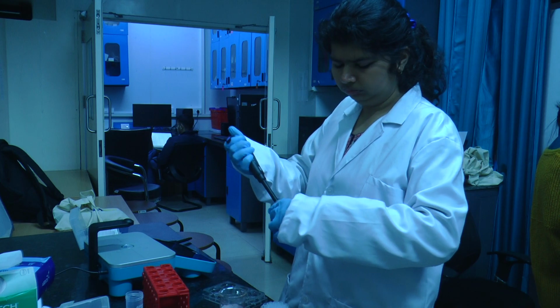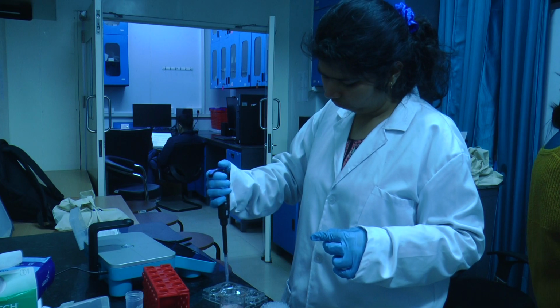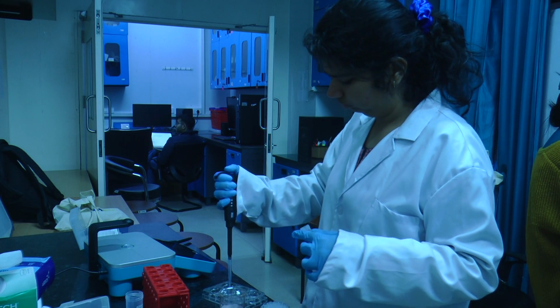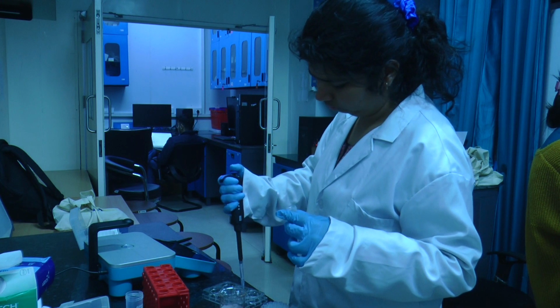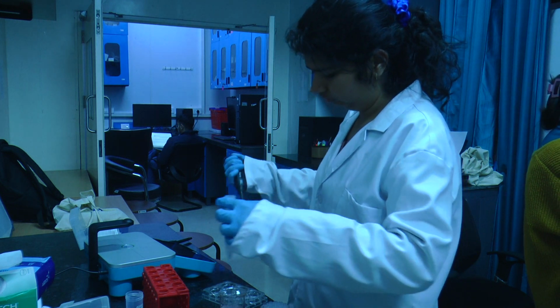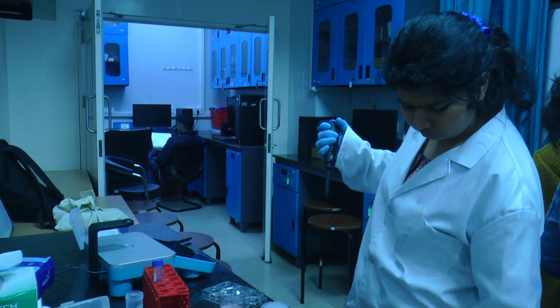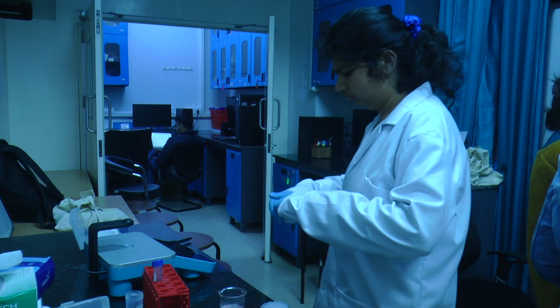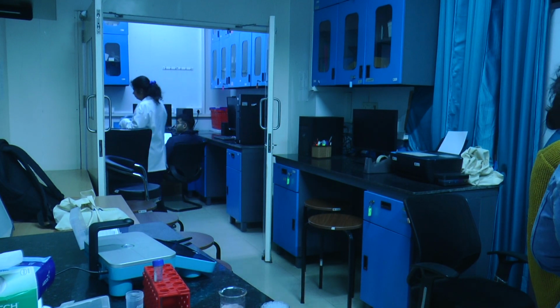So what I wanted to see, we do many experiments on osmolarity change with the GPMVs. So I had the GPMV system also, and according to the theoretical studies, everyone has talked about that when we keep on adding some components, the rigidity will keep on increasing. We assume this in our mind, and if I'm claiming that GPMVs are the replica of the cells, it has so many things. It has cholesterol also, it has protein also, it will be very rigid. So I wanted to see how they behave if I did the same amount of osmotic change.